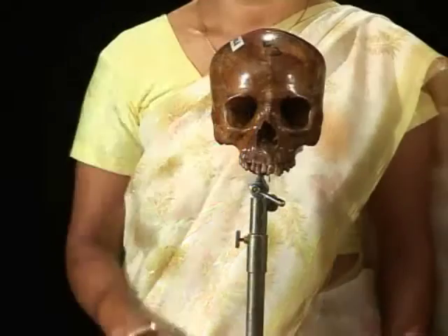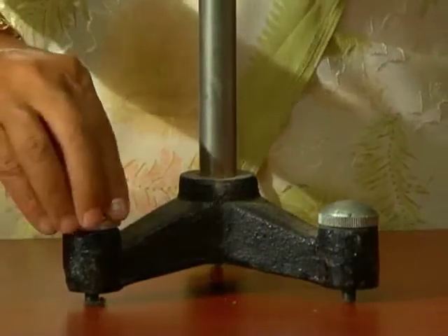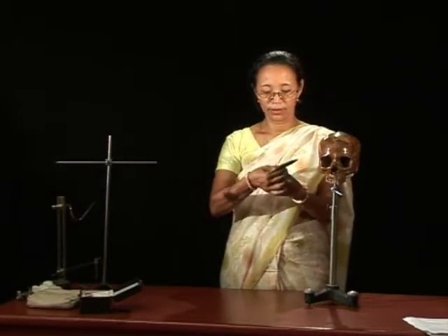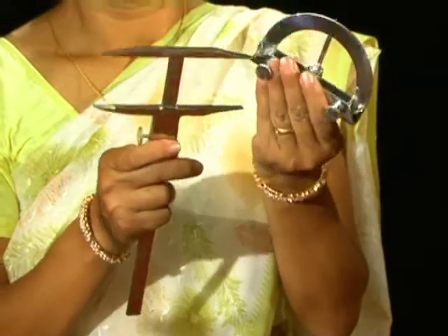The height of the tubular craniophore can be conveniently adjusted using the screw provided at the side. Further, adjustment can be done with the help of the adjustable screws provided at the tripod base. Assuming that all the required planes are in the same plane, the required angular readings are recorded using sliding caliper to which the attachable goniometer is fitted to it.